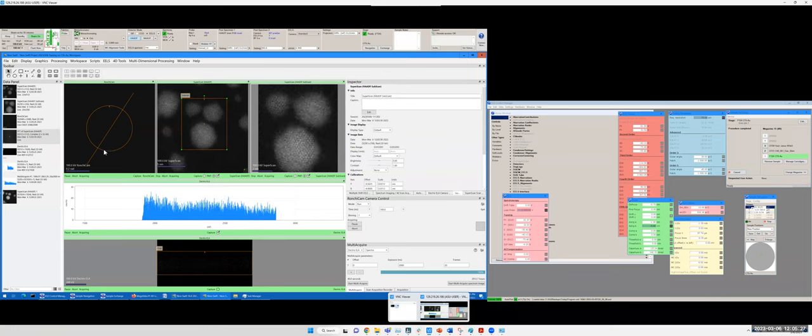Inspector, actually, this is important. For each image you acquire, right? You want to change the information, like name. So you click inspector and type in the name, 001, like test. Yeah, something like this. Okay, so we can blank the beam for now and go to this image.